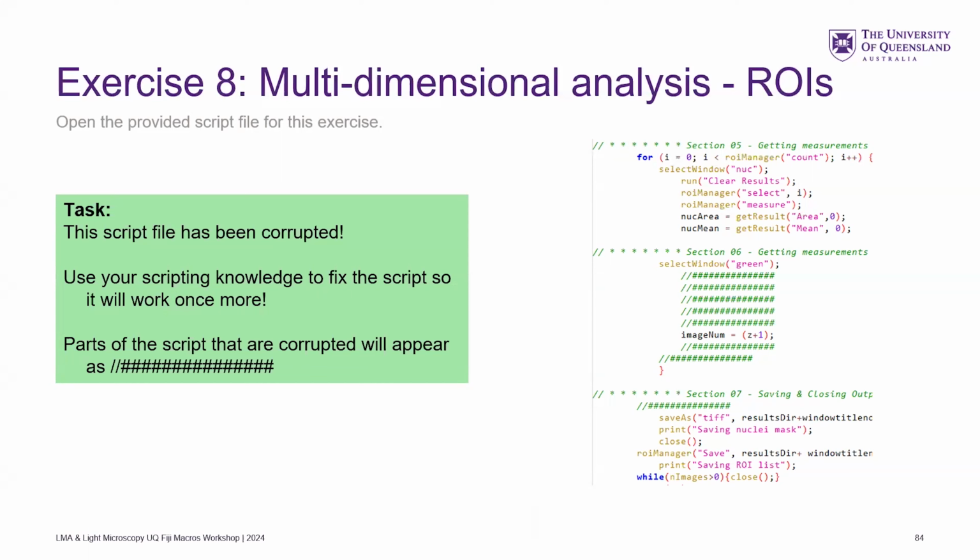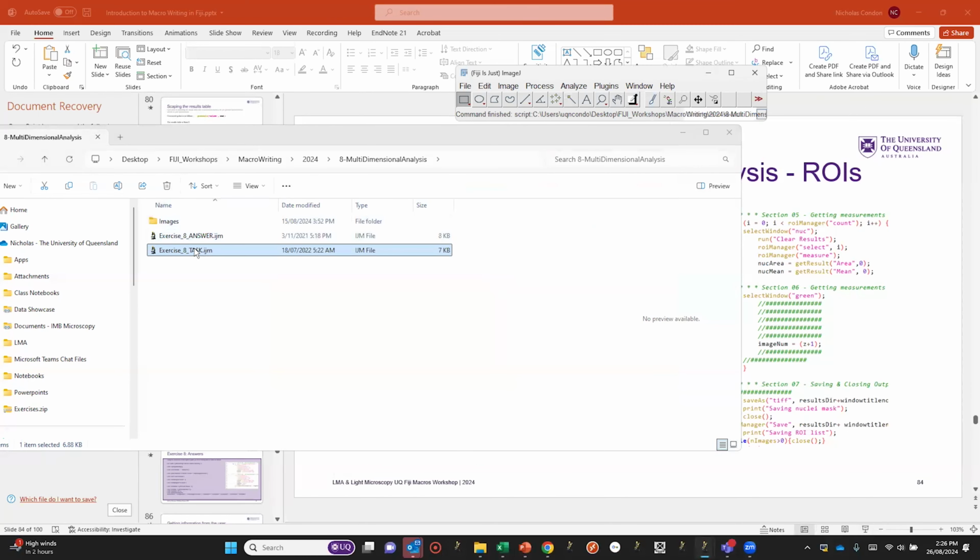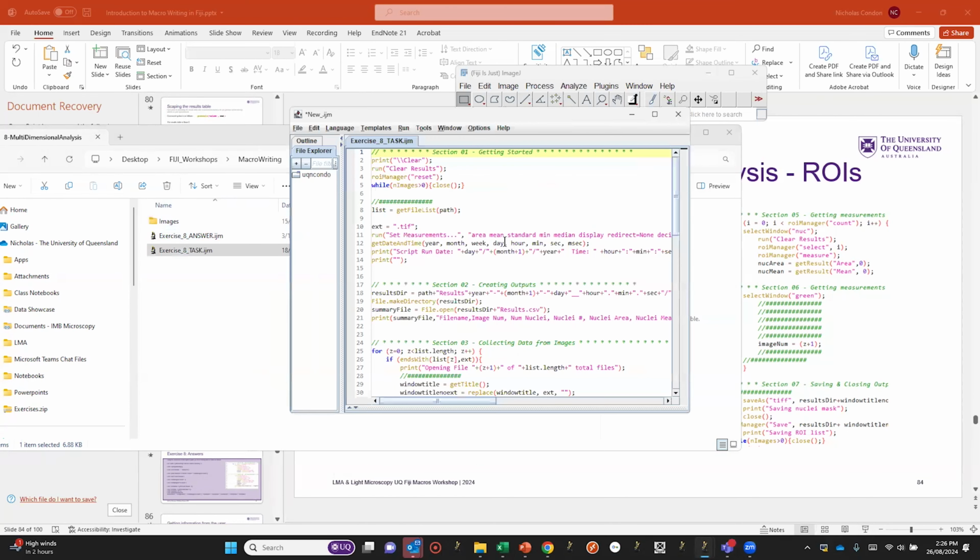So hopefully from the exercise, and I've given some hints with the documentation in here, try and see if you can figure out filling in the gaps as to what's not working anymore. So any of these commented out hash strings, you would obviously make sure you remove the comment bit, but they are where code belongs. So if you open up the file that's in the example one, oh good. That's just my Fiji's having a moment. That looks better.